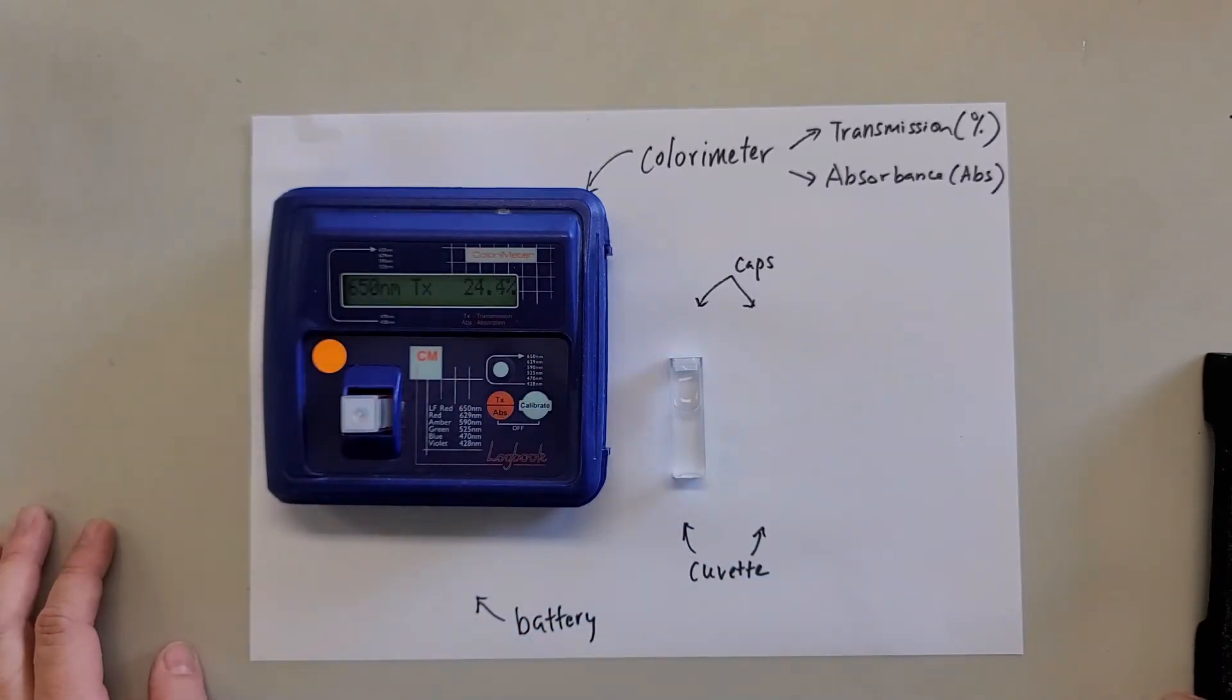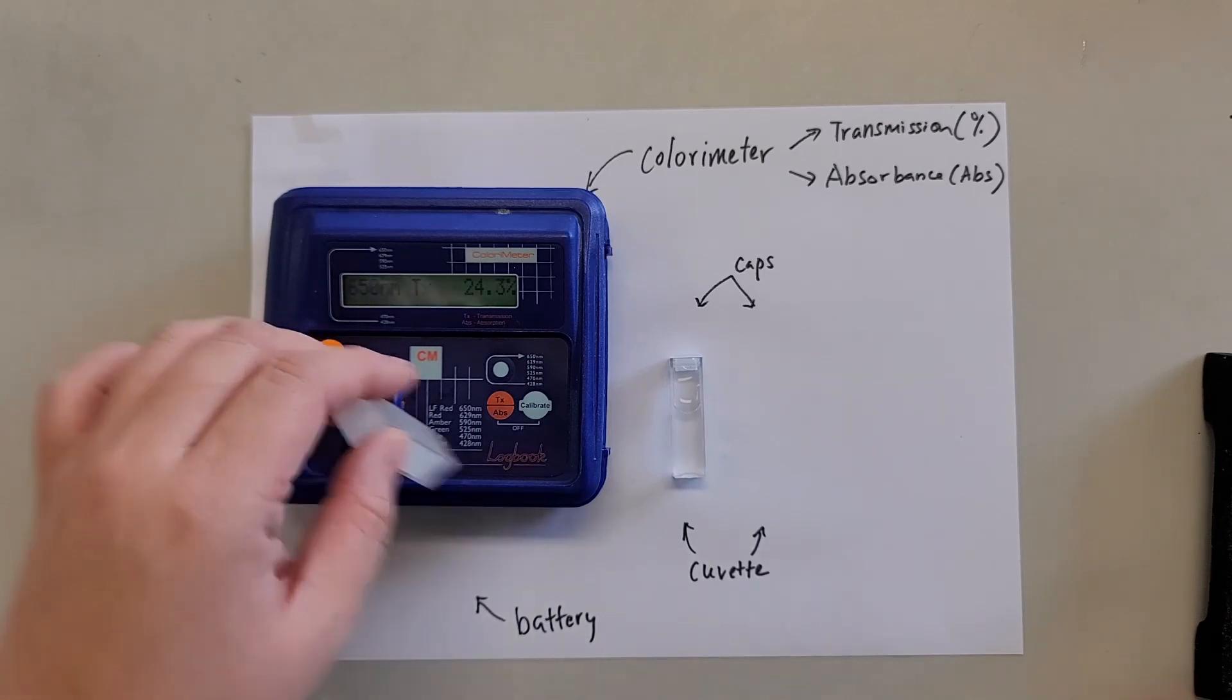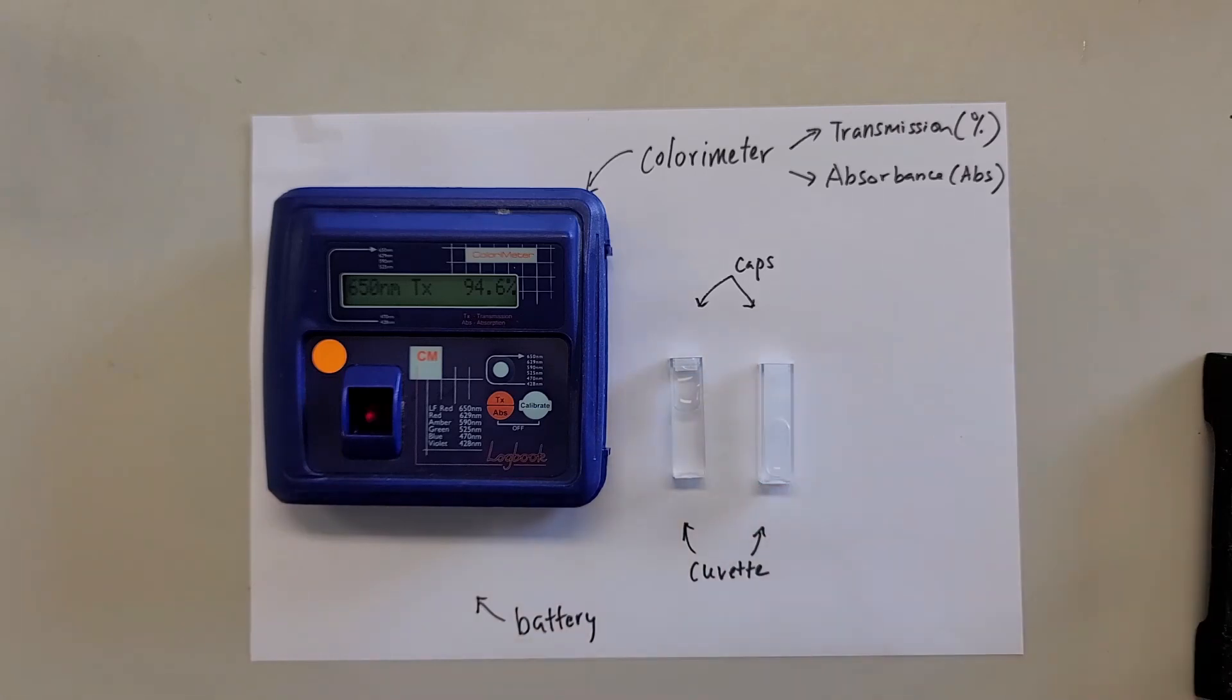Now after one day, the transmittance drops until 24.5. So that's how you can measure the microbial growth using the transmission method. I hope this video helps you in understanding how the colorimeter works. So that's it for today. Thank you and bye for now.